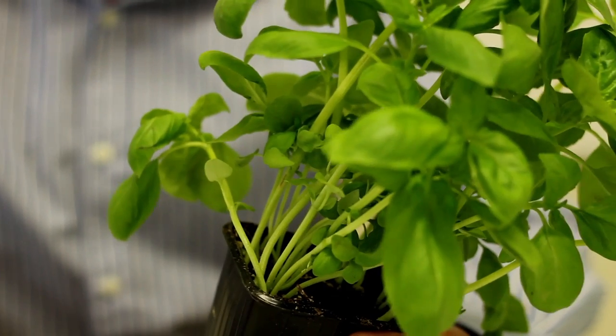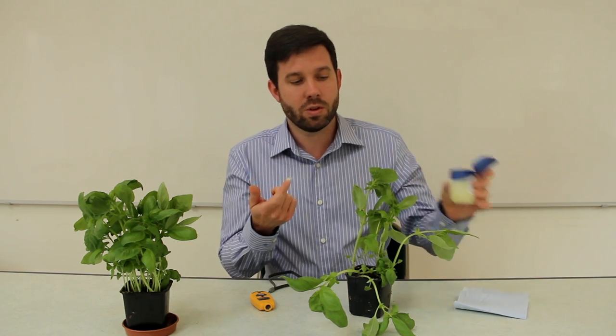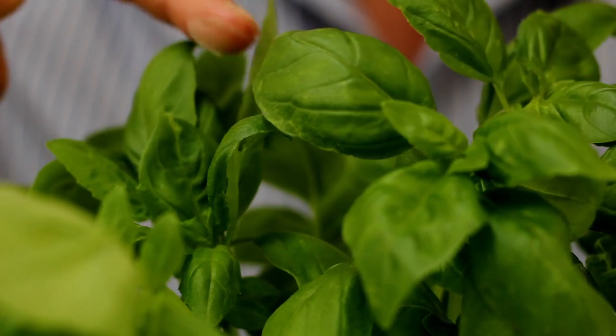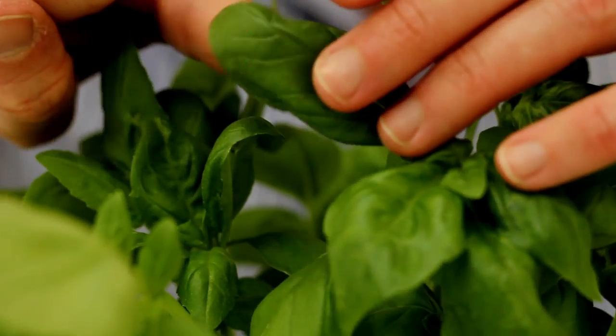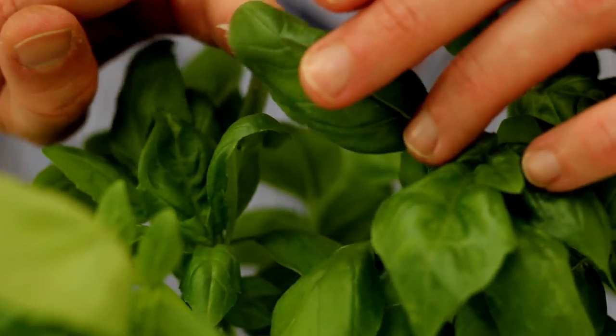What we're going to do is give students an investigation. We're going to ask: what happens if we use some petroleum jelly and apply a film of it to the underside of a basil leaf? I'm using basil leaves today because basil plants are easily available from supermarkets — you can get them all year round.